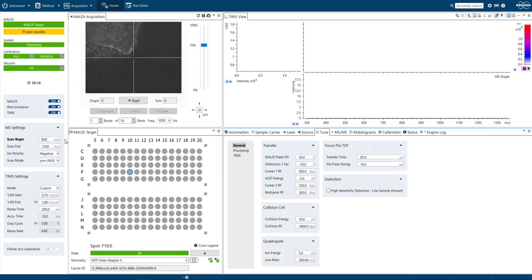For this experiment, we started with the multi-TIMS MS1 acquisition method, which we now additionally need to tune for our MS fragmentation experiment. Here, the first thing that we need to do is to reduce the scan begin in order to also see our fragment masses. Additionally to adapting the m/z scan range, we now want to ensure proper ion transmission of both our precursors and our fragment masses through our timsTOF instrument.